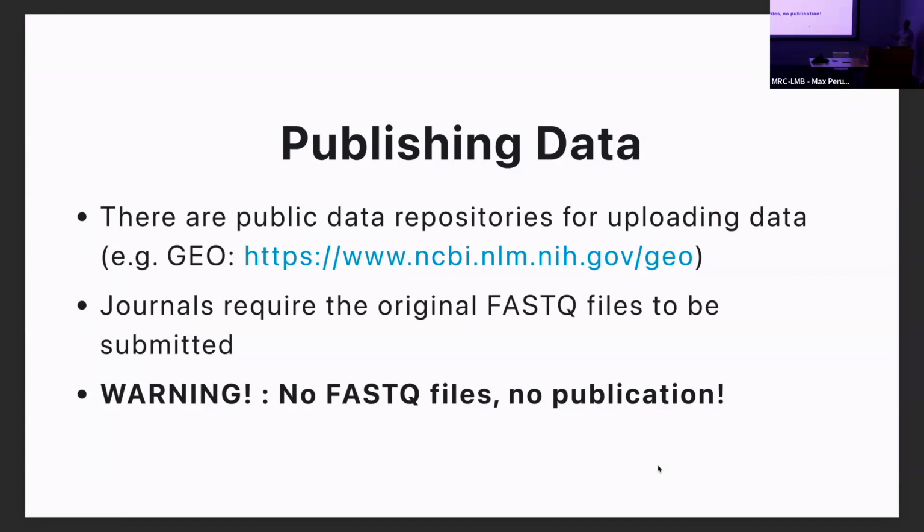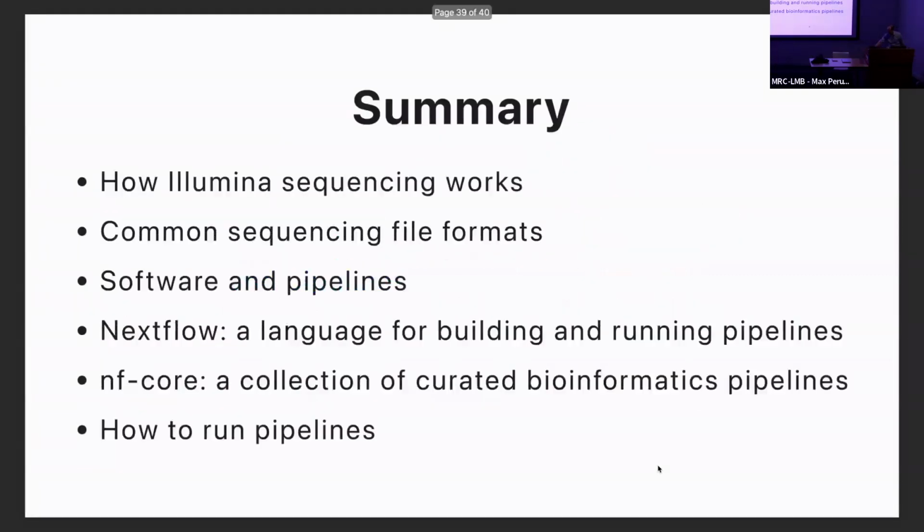You don't want to be in a position when after 4 years, you've done your sequencing, you've done your experiments, you've done all your analysis, you come to write your paper, and then Cell or whatever will say, deposit your FASTQ files on an external repository. You've lost them, and then that's well, we're not going to publish any of your work. That is what will happen. So look after sequencing data like gold dust.